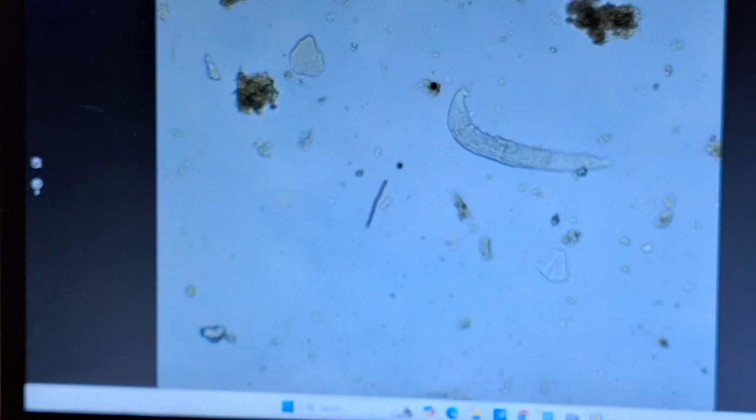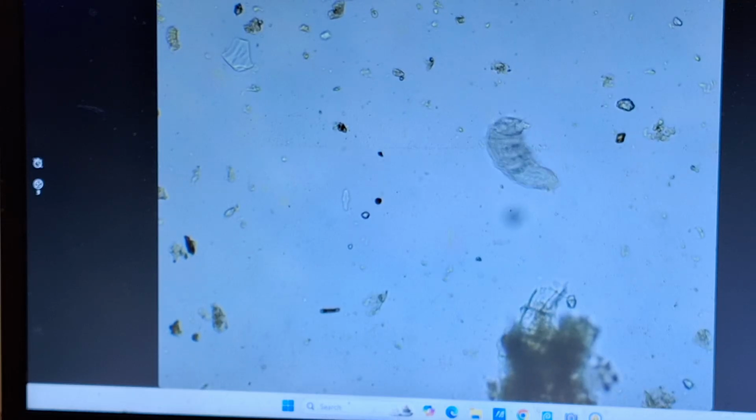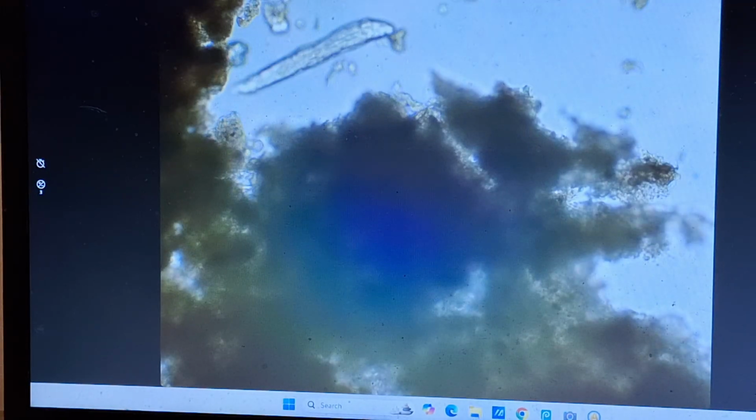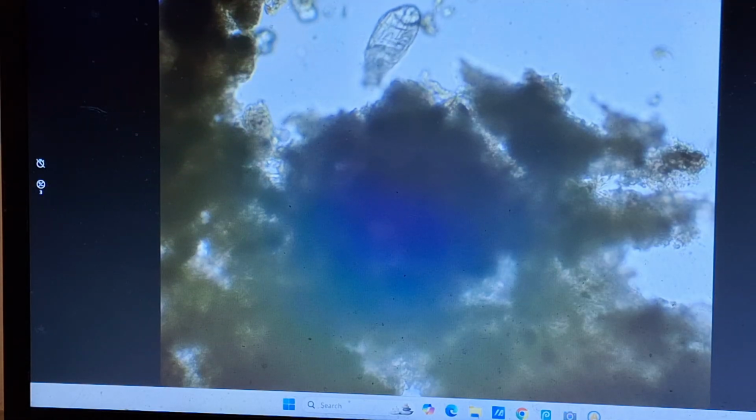I'm going to catch this rotifer feeding. We'll have a look at it. It's really neat to see. It's a microscopic animal. We're zoomed in 40x right now. It'll stop and get 2 little vortex mouthpieces going. I should say 2 spinning mouthpieces, creating a vortex. We can't see it right now. It's happening. See him spitting the stuff out.